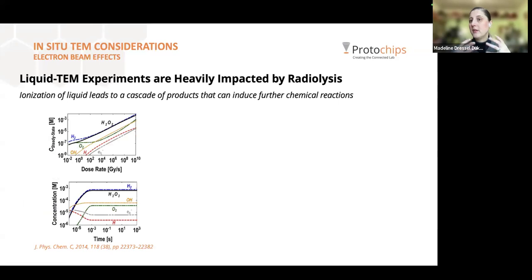And so Francis Ross did a lot of really wonderful seminal studies of what the dose is doing to our solutions. And generally, most researchers who are doing this type of modeling stick pretty much with looking at water, because other systems are really complex, or they look at the radiation chemistry literature to see what types of radiolytic products they should expect from their solvent.